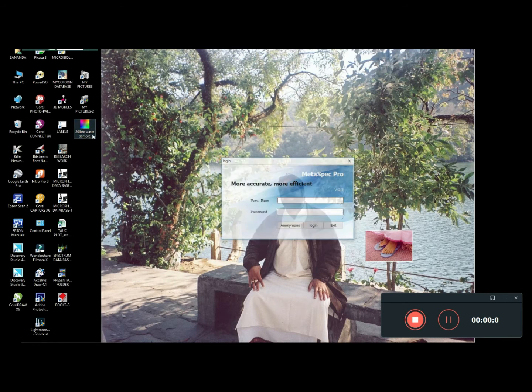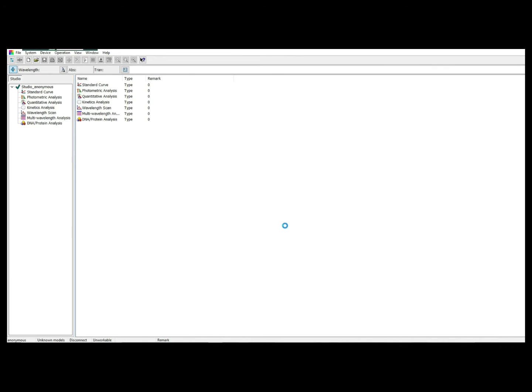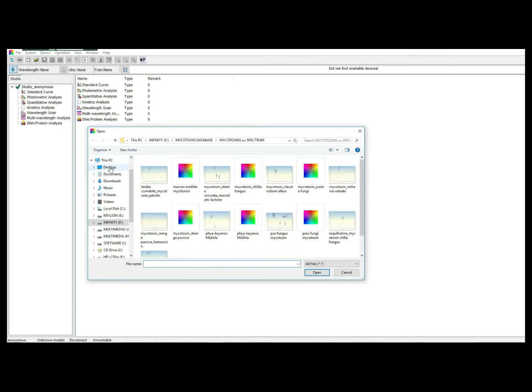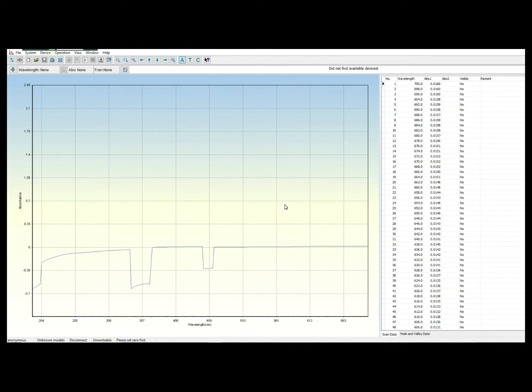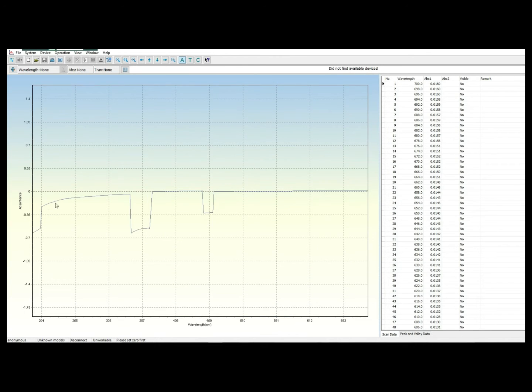So friends, the UV spectrum study has been done. The file is opening, and as you can see, in this spectrum there is a negative side evolution of the curve. This is because the polar water molecule has captured the polyethylene. So friends, you have seen from the spectrophotometer curve that there is a molecular exchange, a certain molecular exchange has been there, but it has been there in the reverse side.